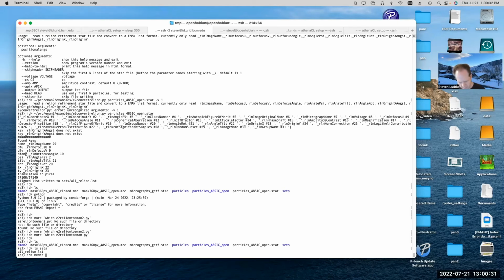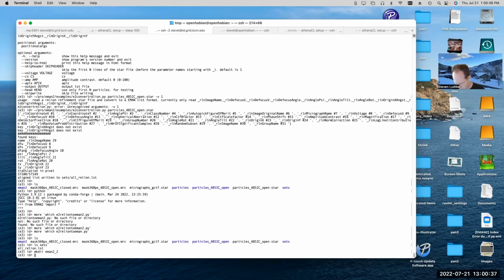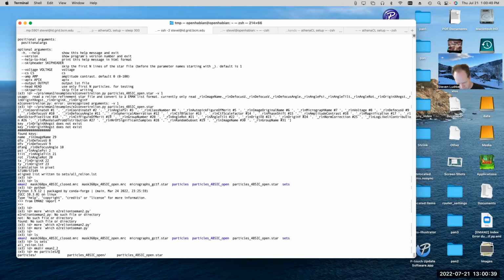So let's make a new EMAN2 folder, and we'll move particles and sets into EMAN2.